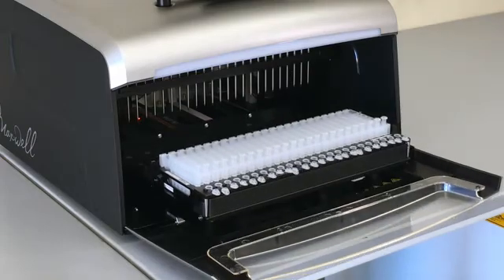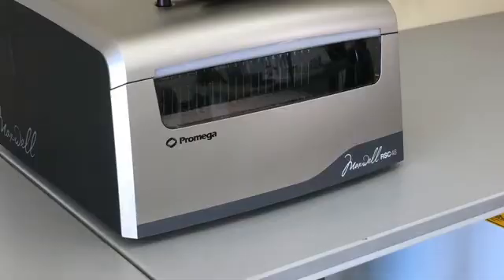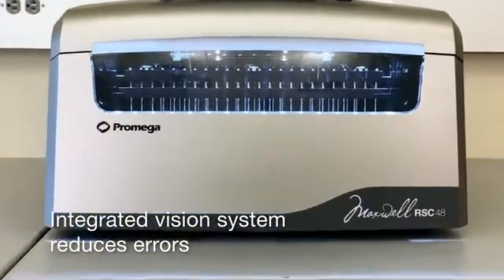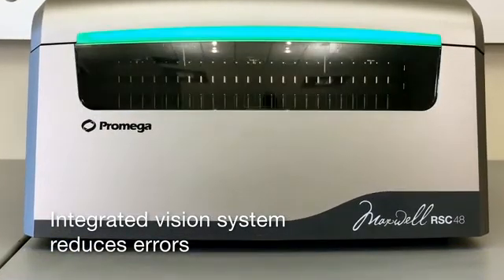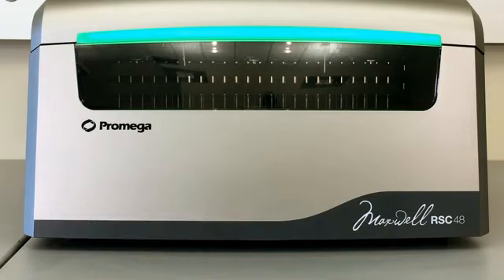The Maxwell RSC 48 extracts nucleic acids from 1 to 48 samples. An integrated vision system scans each tray prior to extraction and notifies you of any tray setup errors like missing plungers, cartridge positions, or closed elution tube caps.